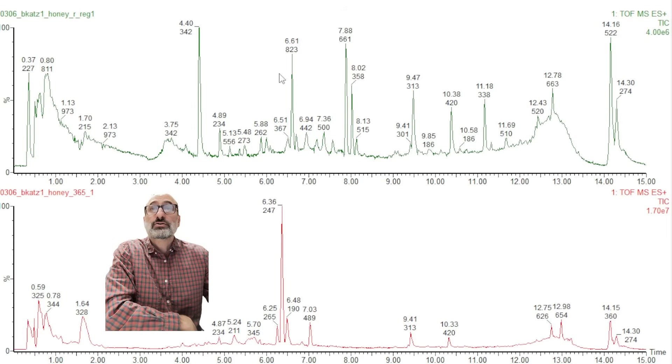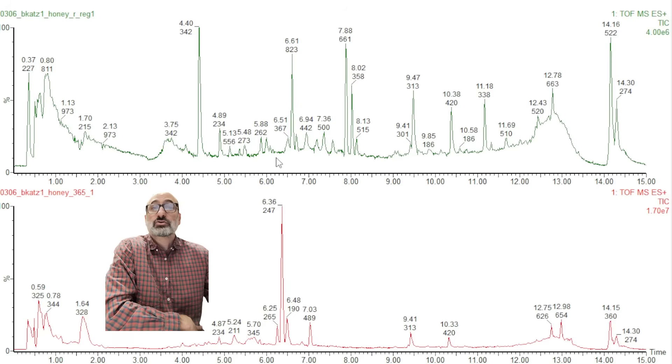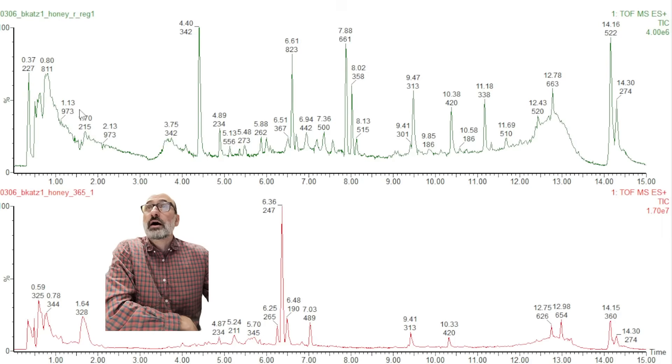First off, you're not seeing the 247 peak. And so I can't even confirm that this royal honey is honey. Like it could just be like sugar syrup of some sort. But then you can see that in this royal honey sample on top, there are a lot more individual peaks that we're not seeing down below.